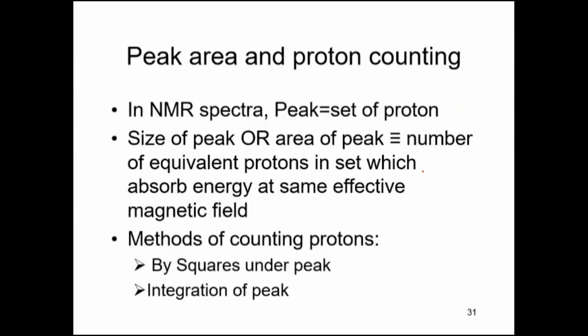How to calculate peak area, and from that peak area, how to count how many protons are present in the molecule giving the NMR spectra.